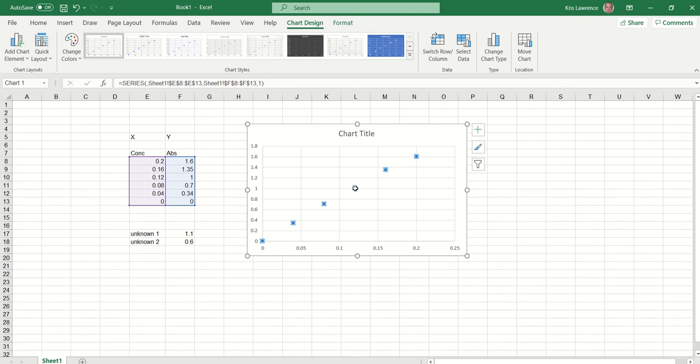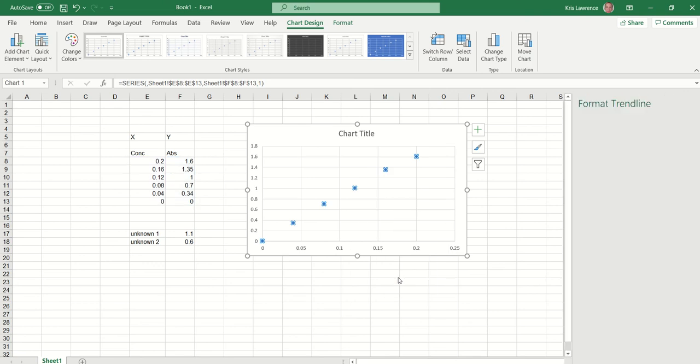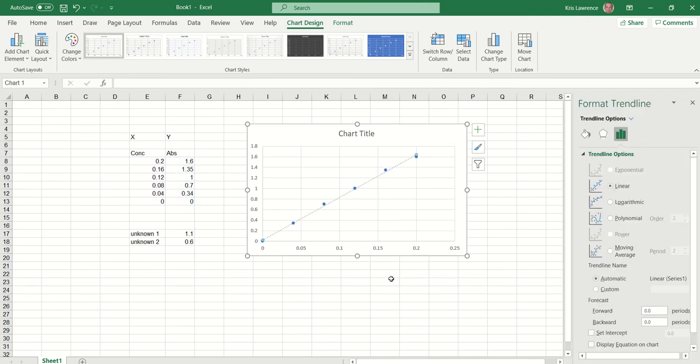First thing: select any of your points, left-click, then right-click on it and add a trend line. So we get a line of best fit there.